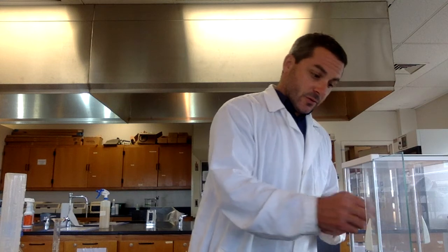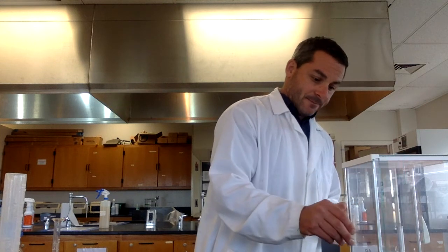So that's how you can relate density in real life. You can feel how heavy something is. In order to find the density of this, I need to find its mass and its volume. The first thing I'm going to do is find the mass. I'm going to weigh that on the balance. Make sure your balance says 0, so I'm going to hit the tare button so it says 0. Then I'm going to put the metal right on there and record its mass.